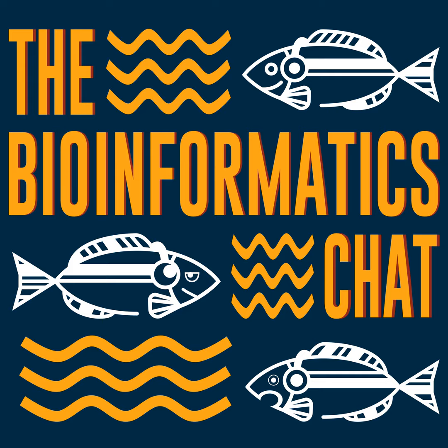Tagging a physical object will require just applying a solution. Let's say you've already got the tag made. We can go into that more later on. But let's say we've got our tag, our DNA solution. We can apply it to the object, and as long as it can dry successfully on the object, it is seemingly relatively stable according to the tests that we've done. Then all that is required to read it is just rehydrating it and throwing it directly on the Nanopore MinION device without any further sample prep. So it's really convenient by pushing the sample prep to the side of when you create the tag, and then when you read it out, the trade-off is that it's very quick. You can do this within a few seconds to minutes.